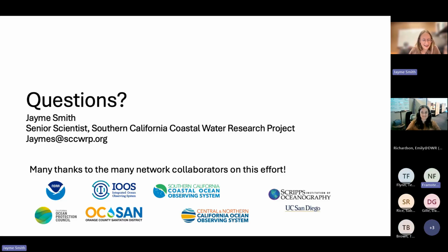Hi, thanks for the great talk, Jamie. I was interested in how much fine tuning it generally takes. If you're going to run this in a flow through system on a boat or on a pier or something, and you have differing lengths of tubing leading from the actual outside water to the IFCB, is that something that you have to control for in these deployments?